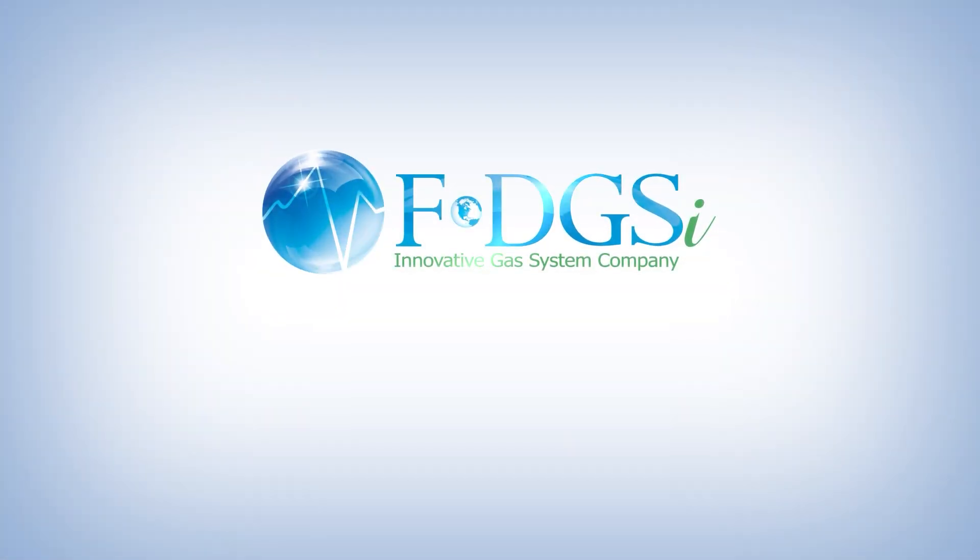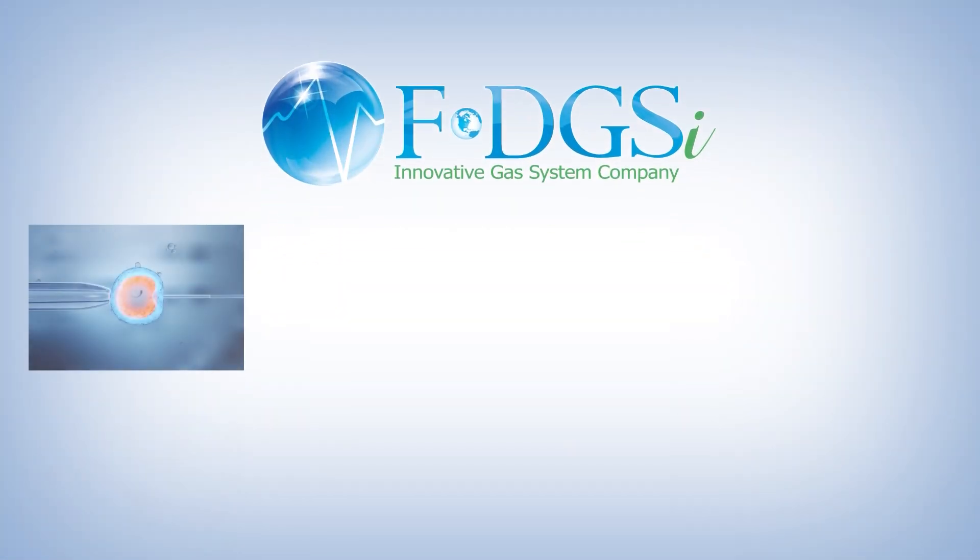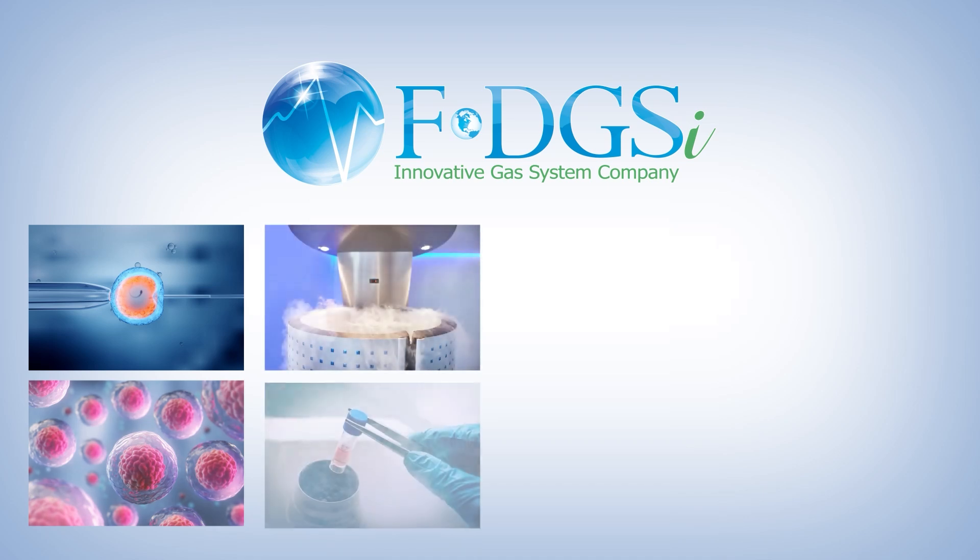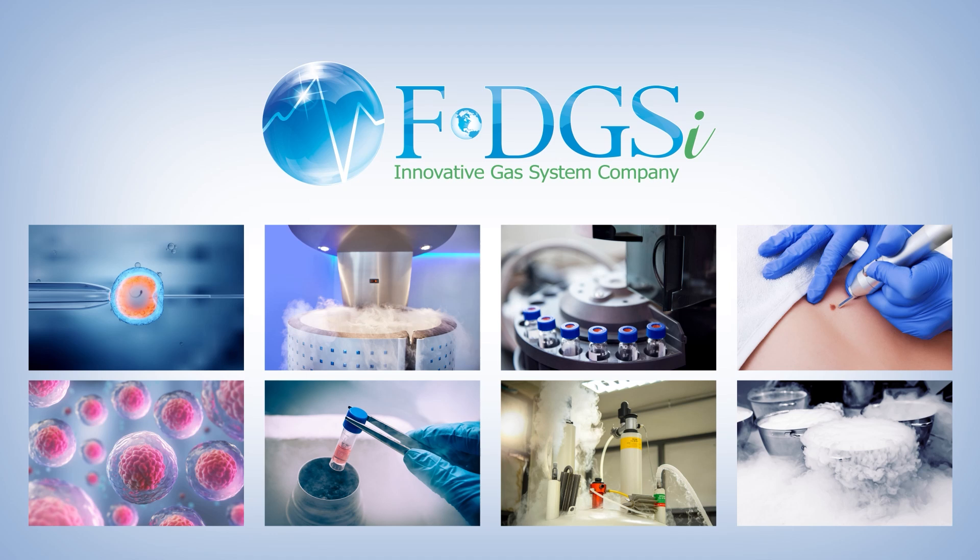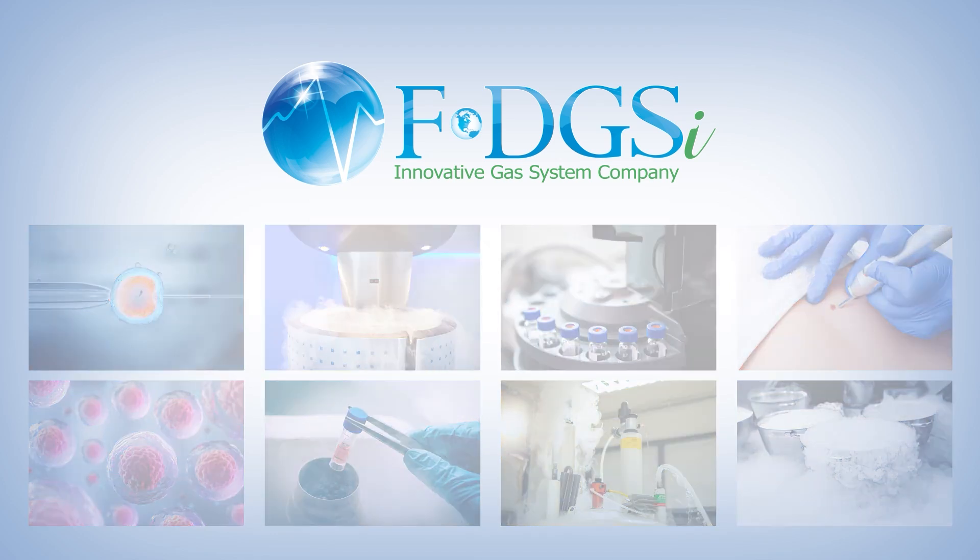Cryogen plays an important role by supplying liquid nitrogen for many applications. From IVF, cell preservation, cryotherapy, cryopreservation, GC2D, NMR, dermatology, metal treatment, and more.